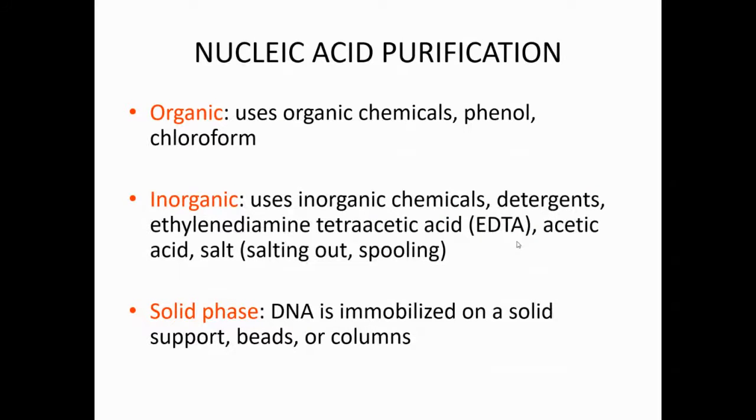Okay, so until now, we discussed how to obtain the cell and then break the cell to release the DNA into the solution. Once the DNA is released into the solution, the next step is to purify the DNA from the crude cell extract.